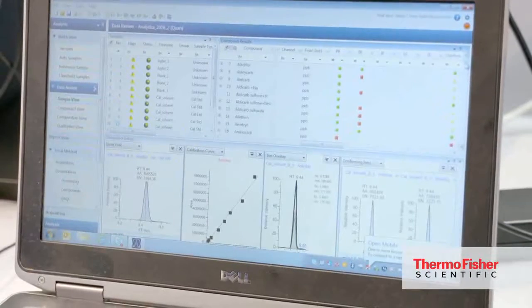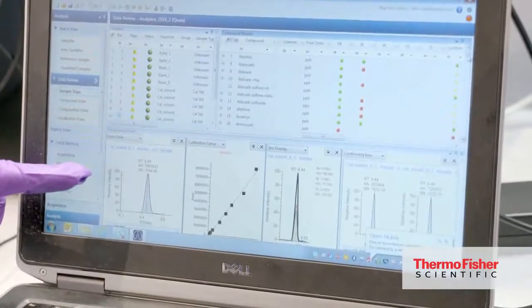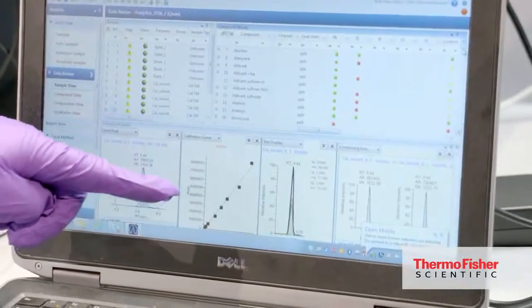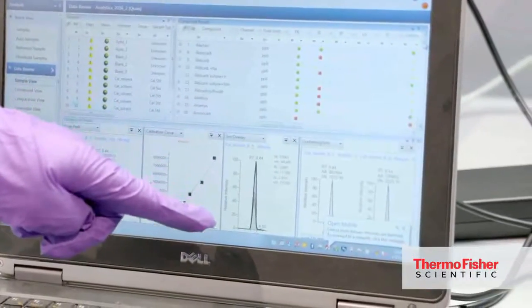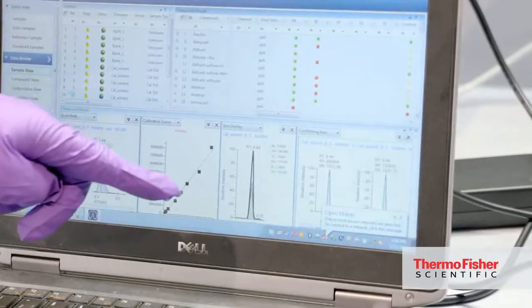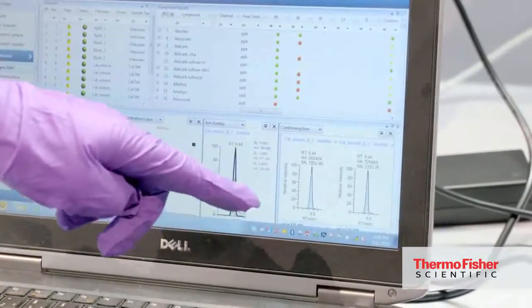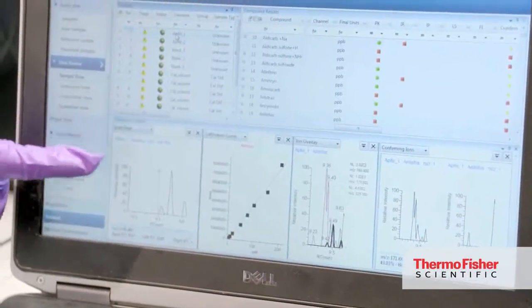But more interesting is really the pictures showing the quantitative peak, the calibration curve, the ions - the confirmation ions overlaid with the main peak. And you see also the confirmation ions in a separate window.